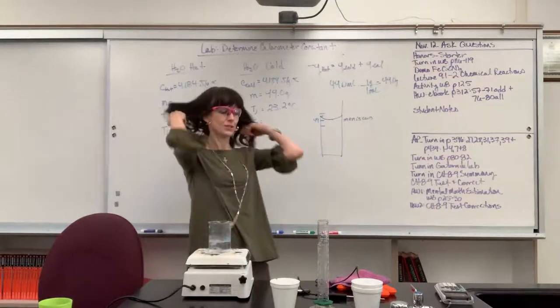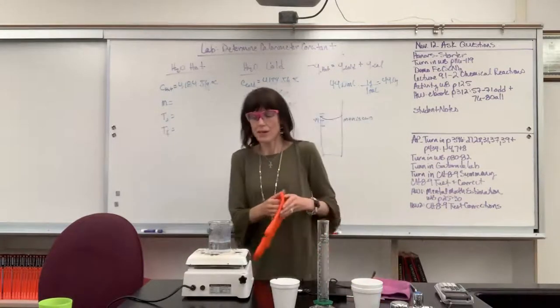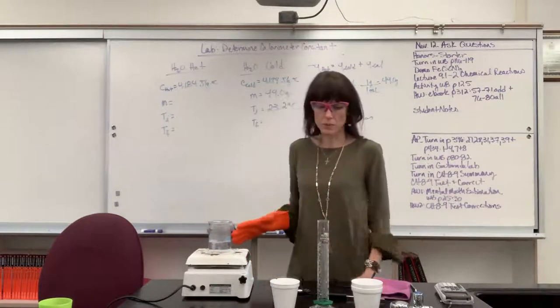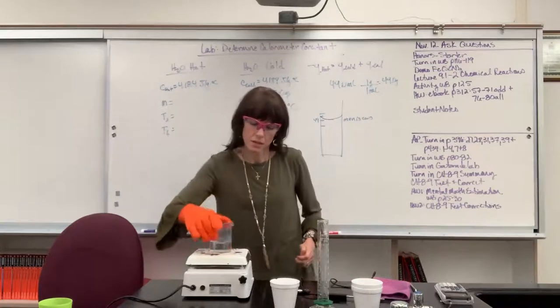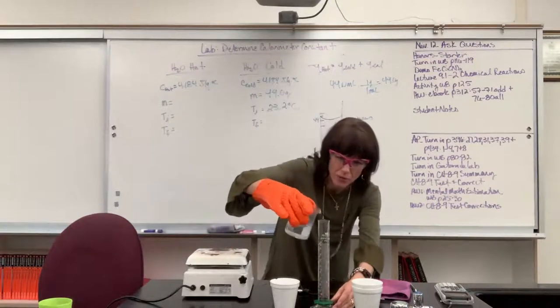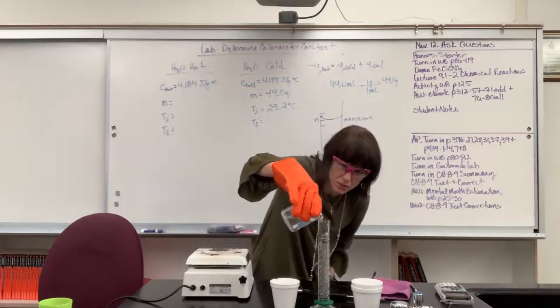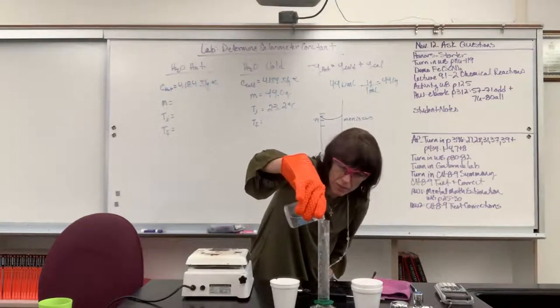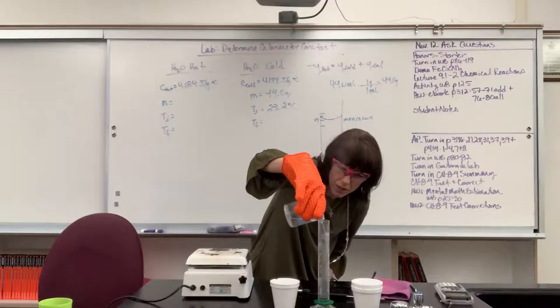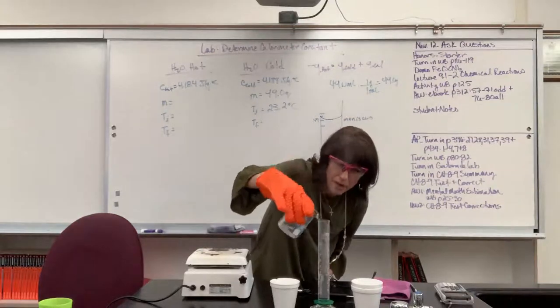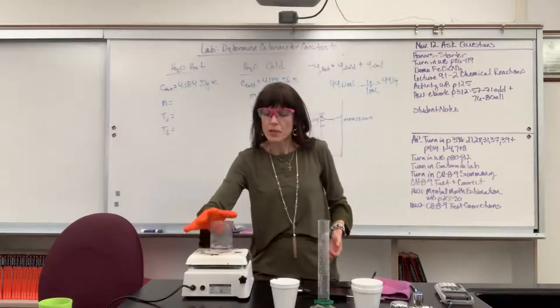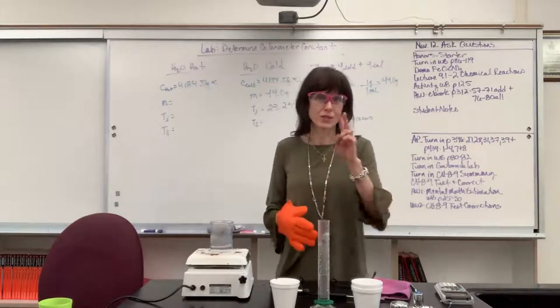Now, we are going to do the hot water. So I got this boiling. I have my silicone gloves so that I don't burn myself. And I'm going to pour about 50 mils, close to 50 mils, in my graduated cylinder. And this is my hot water. Now, doing two trials, I have about another 60 mils, so put enough water in there to get boiling so you can do your two trials.